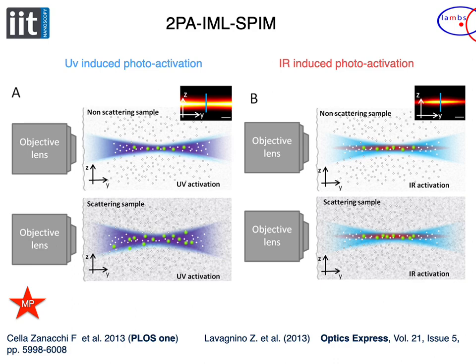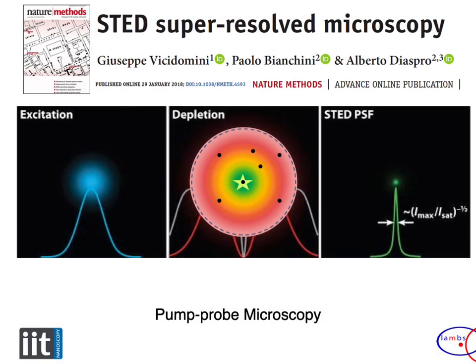But now, if you leave the single molecule, you can go to the Stefan Hell method instead. Stimulated emission depletion. What does it mean? It means that I bring the molecule to the excited state. When they're close to come back to the ground state emitting fluorescence, I push them to deactivate in a region where I don't watch the signal, the red region. I watch in the green. And I play this game in a very targeted way, with a kind of pinhole made by a second beam properly shaped.